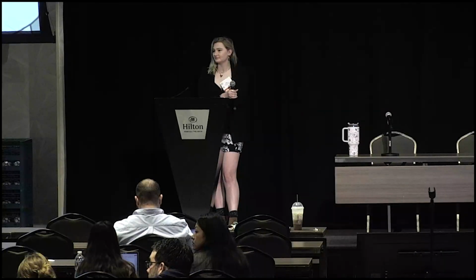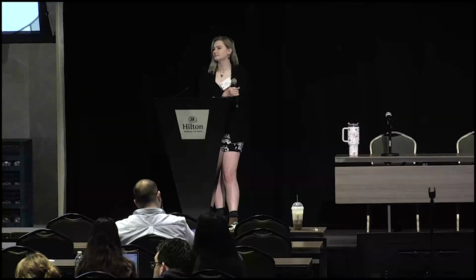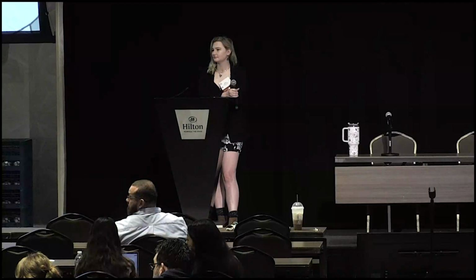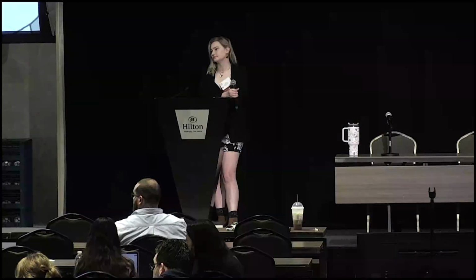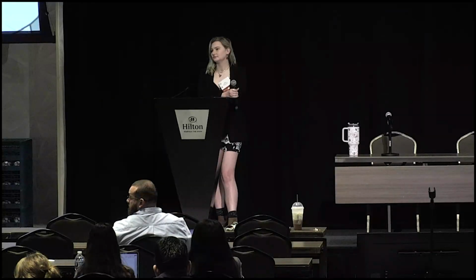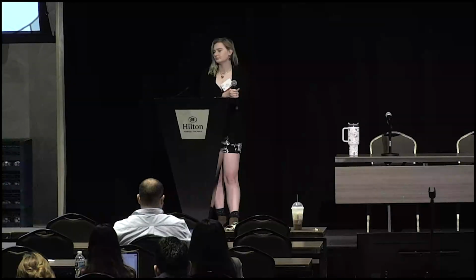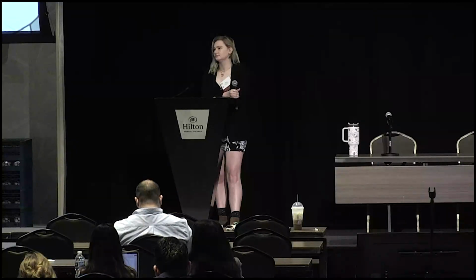Hi, Greg G. from Oregon State. So related to that point on the domestication side, I just thought I'd ask about your thoughts on doing site-directed mutagenesis versus ordering synthetic fragments, and whether you take a hybrid approach or just everything is synthesized in your lab. I'm trying to find a good balance point myself a lot of the time.